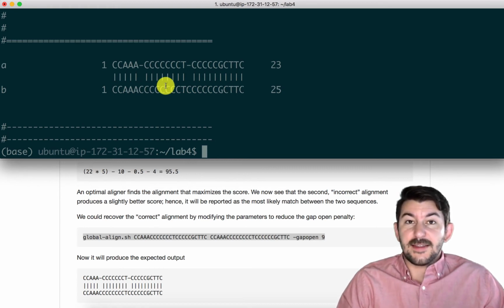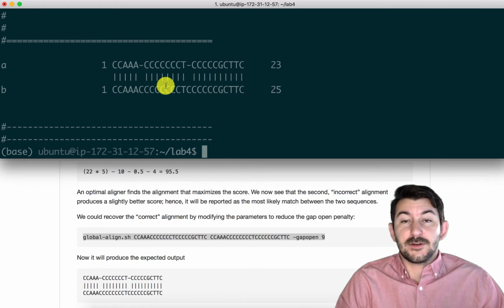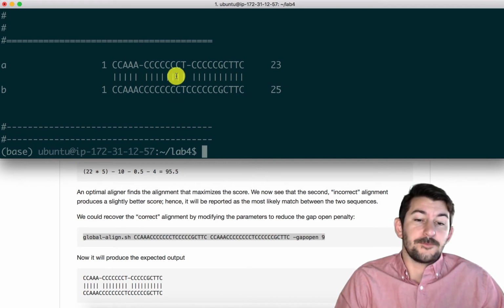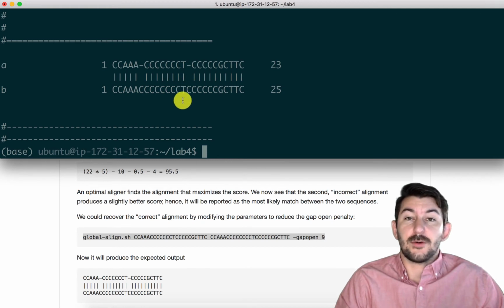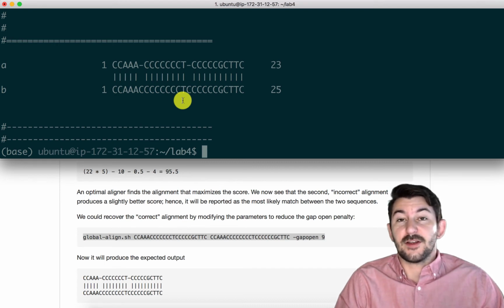But we are only able to get to that because we know what result we want. This is the problem with reconstructing sequence alignments from sequences that are diverging over long periods of time: we don't know what they originally were. And so we have to have a set of parameters that we think are in general appropriate, but know that they may misrepresent some subset of the data.